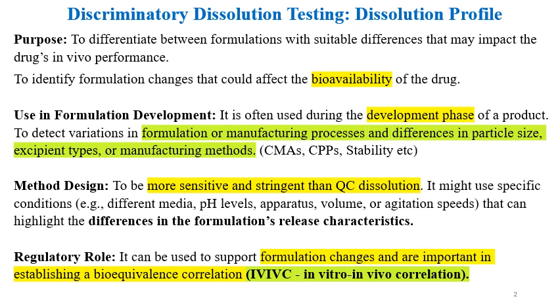So starting with the discriminatory dissolution, always understand that discriminatory dissolution is mainly done in the development phase of the formulation, and always discriminatory dissolution testing is performed with a dissolution profile. So multiple dissolution time points are selected, and for that the dissolution profiling is done.